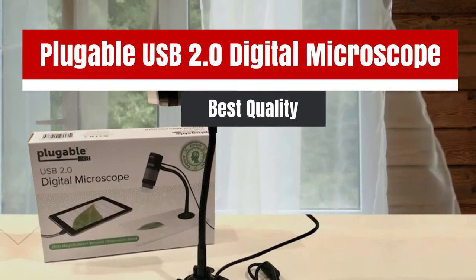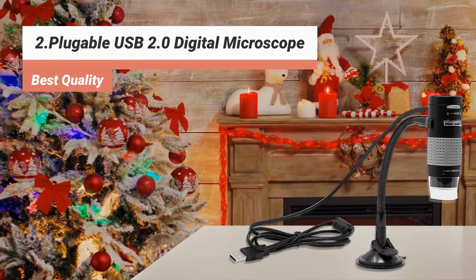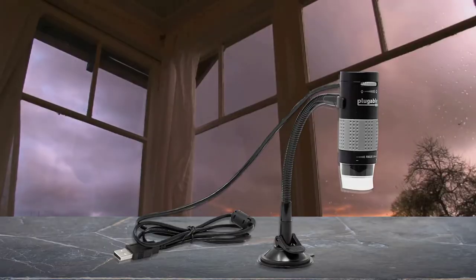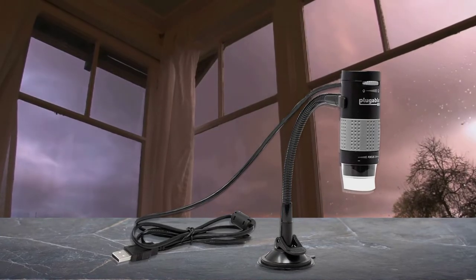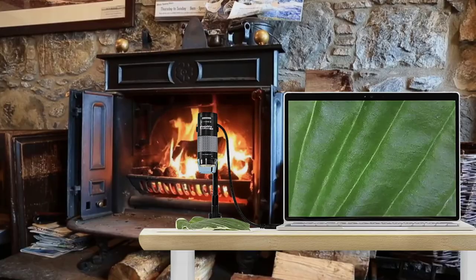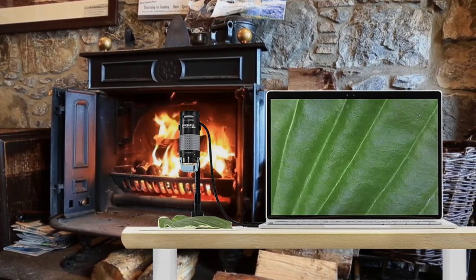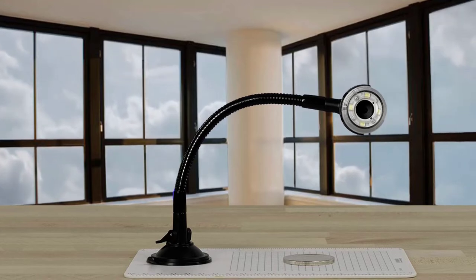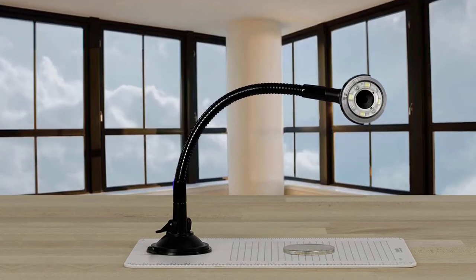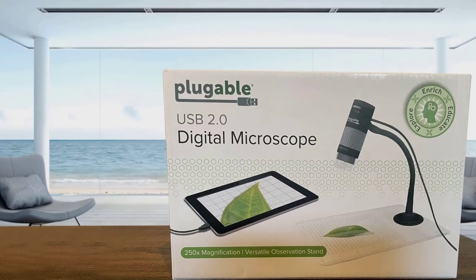The second product on our list: Pluggable USB 2.0 Digital Microscope, best quality. This is one of the best USB microscopes with 40–250x magnification power, and it's just under $50. This portable plug-and-play device lets you take photos and videos. It comes with a 2.0 megapixel camera, a standard webcam chipset, and a CMOS sensor, compatible with almost all operating systems. It features a flexible arm for use with a stand or handheld, four dimmable LED halo lights for adjustable brightness, and a white graduated observation pad for easy specimen measurement.